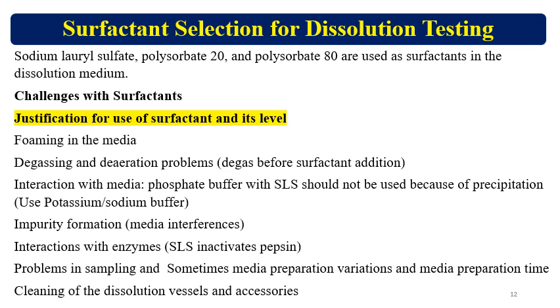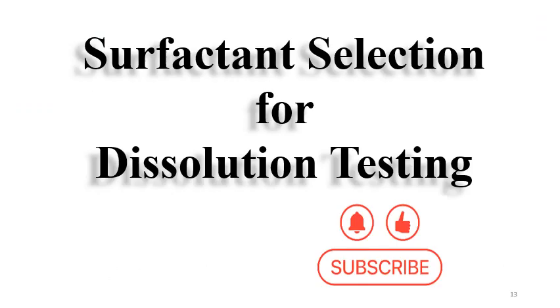Problems in sampling and sometimes media preparation variations and media preparation time are challenges. Then cleaning of the dissolution vessels and the accessories. Because as you are using surfactant, if these dissolution vessels and accessories are not cleaned properly, then surfactant contamination may happen to the other product dissolution testing. So these are the surfactant challenges.